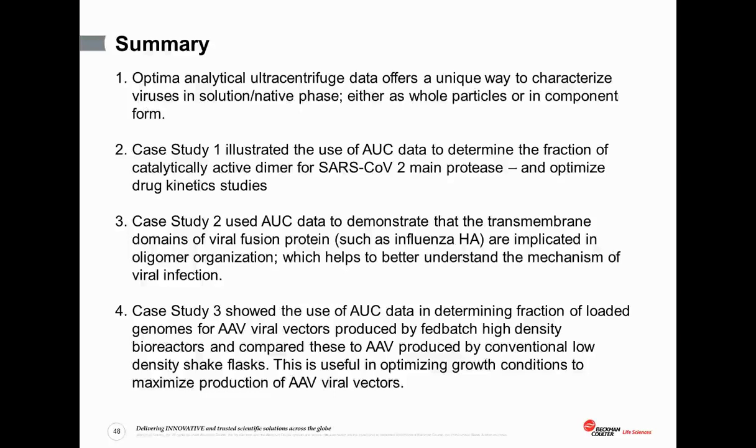In case study number two, we discussed how sedimentation equilibrium data has been used to demonstrate that the transmembrane domains of viral fusion proteins, such as in influenza or in Ebola or in rabies, are implicated in some form of oligomer organization.